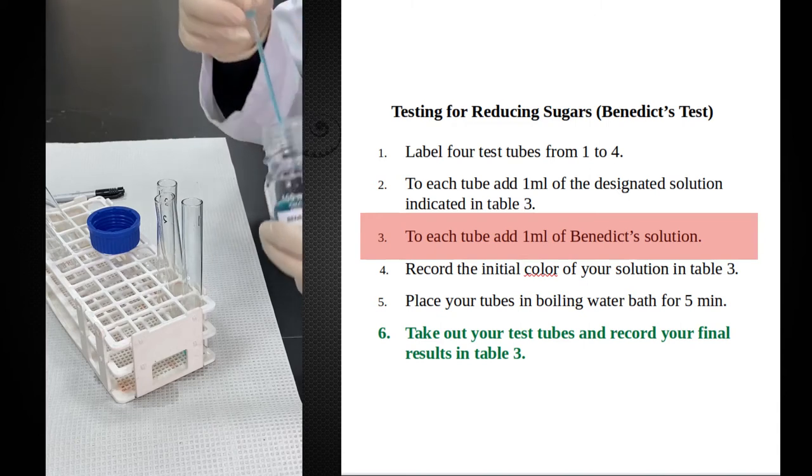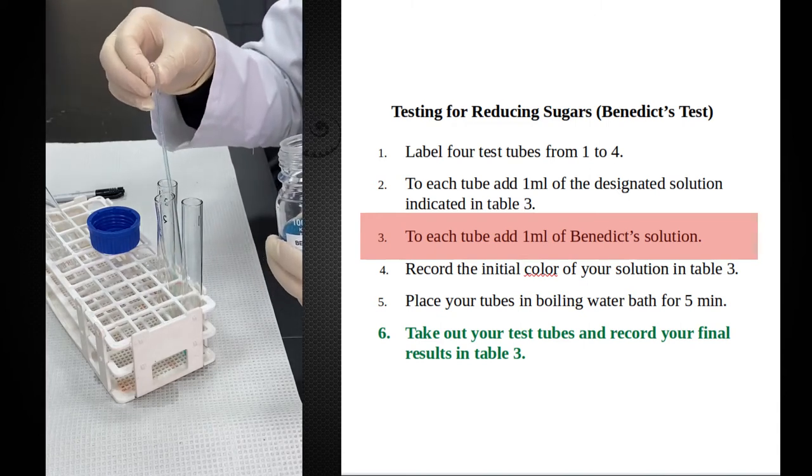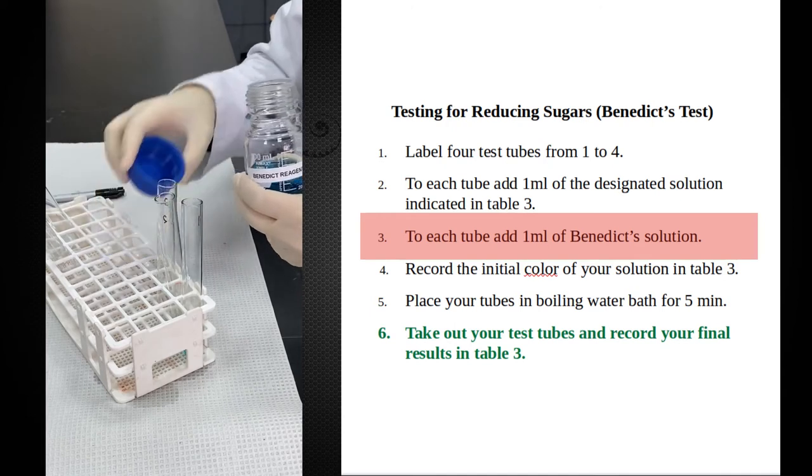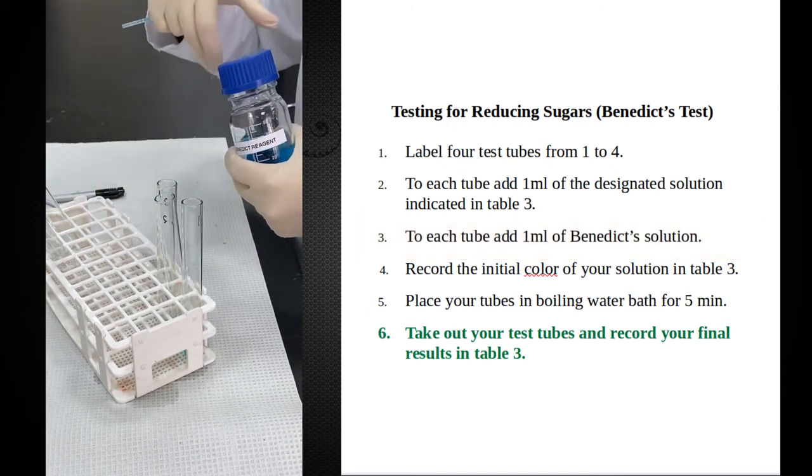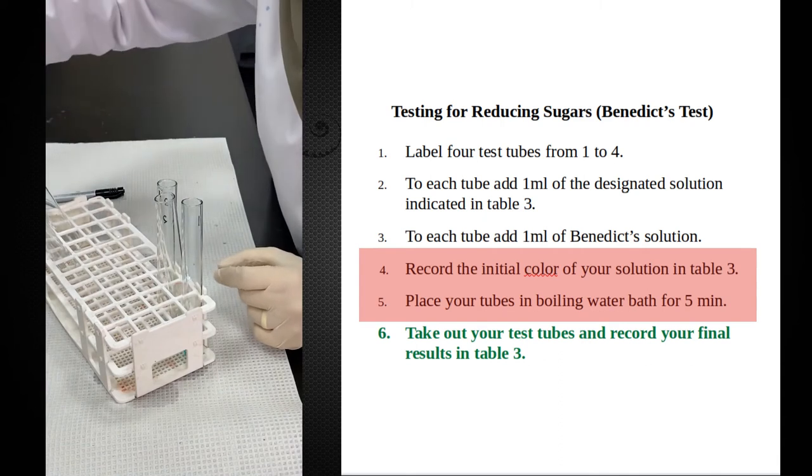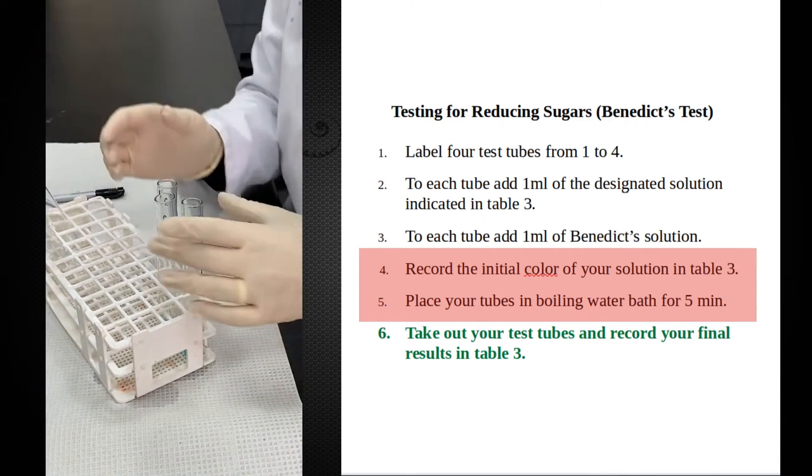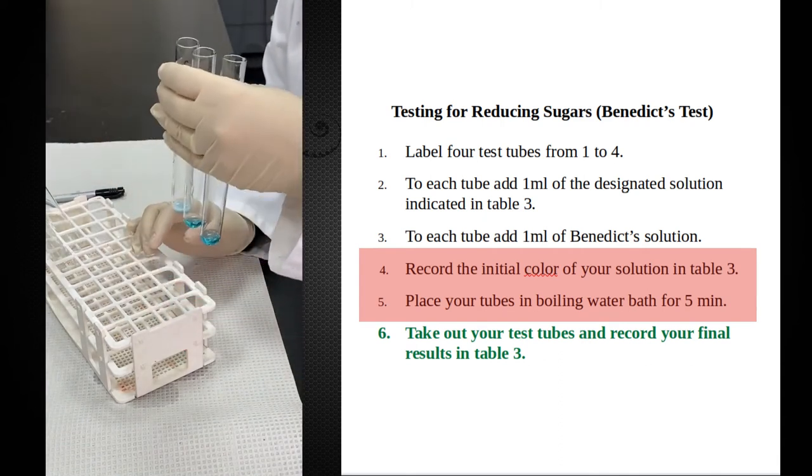This chemical reaction, as we have discussed in the lecture, requires heat to occur. Therefore I am going to transfer these three test tubes to the water bath, to 80 degree water bath for five minutes.